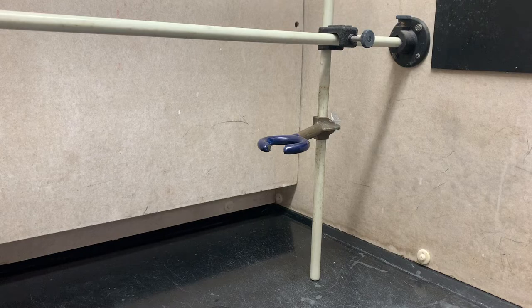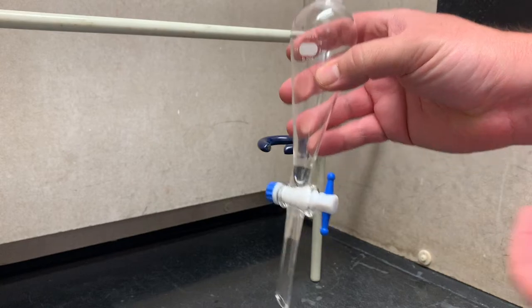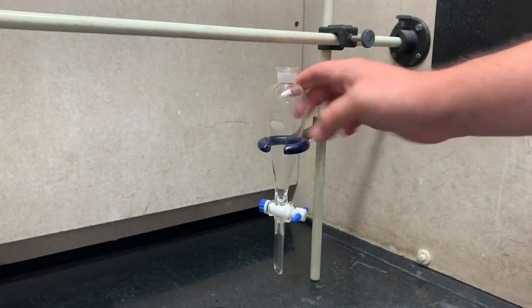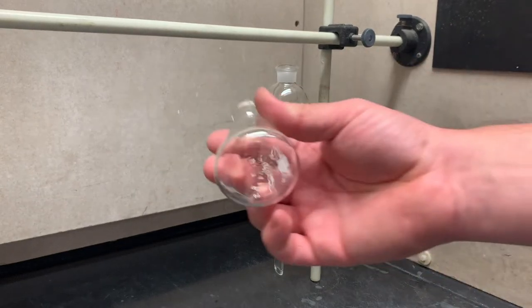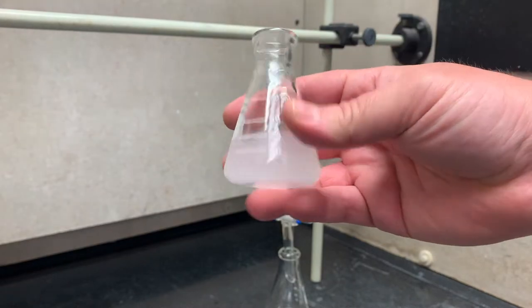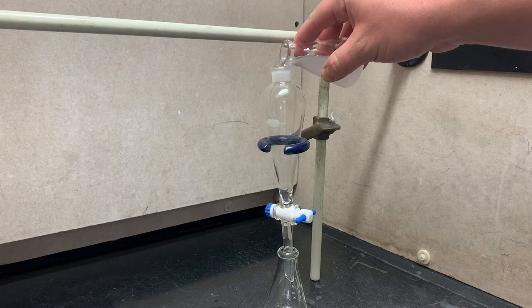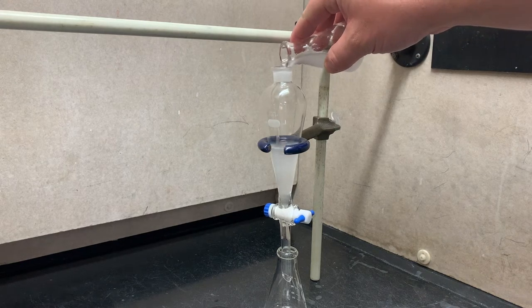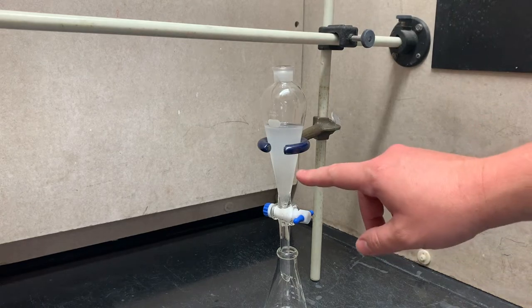Next up, we're going to do a quick extraction. For that, we will need a separatory funnel. Make sure that is closed, and a ring stand to hold it. Got ourselves a cap here, something to collect in, and our solution. This chills relatively quickly, so you should be able to work with it pretty much immediately. You can see that we're already getting the eugenol separating out by itself.